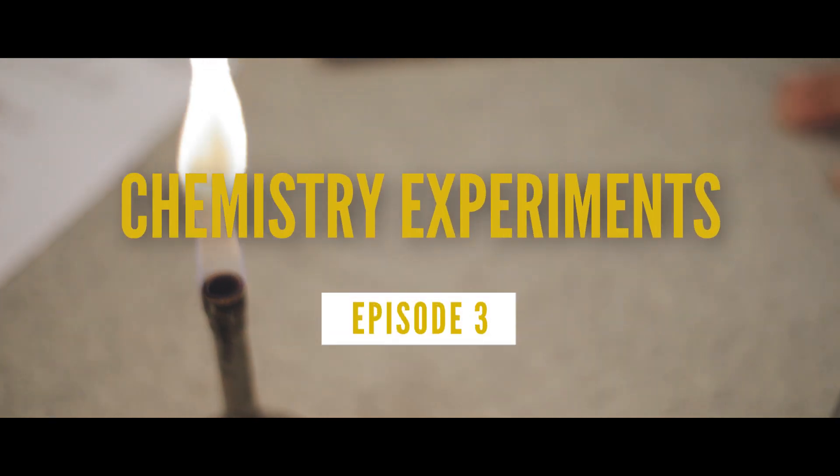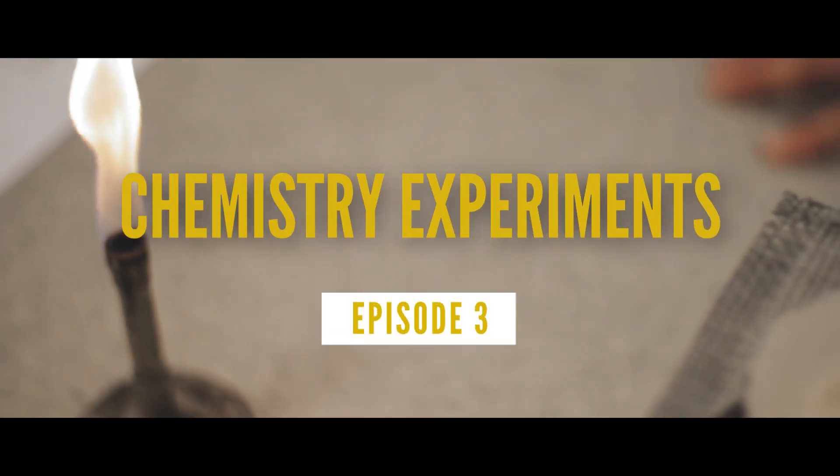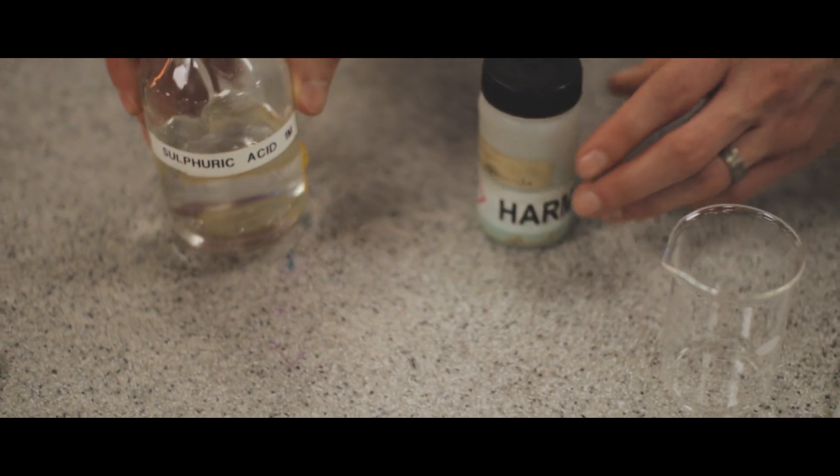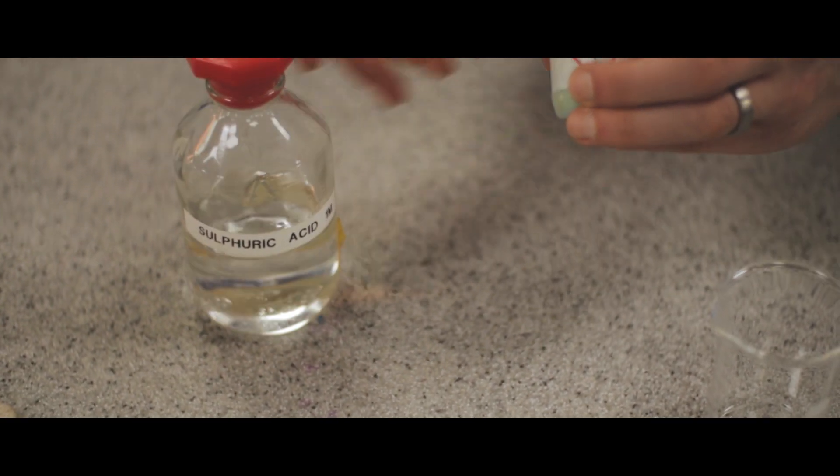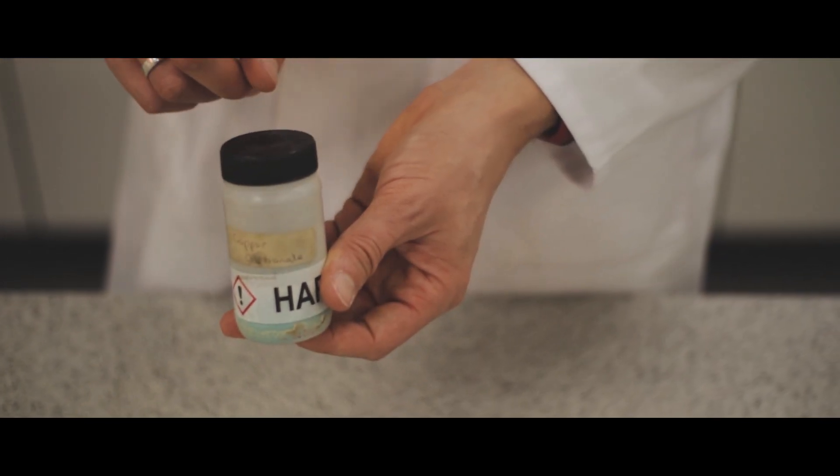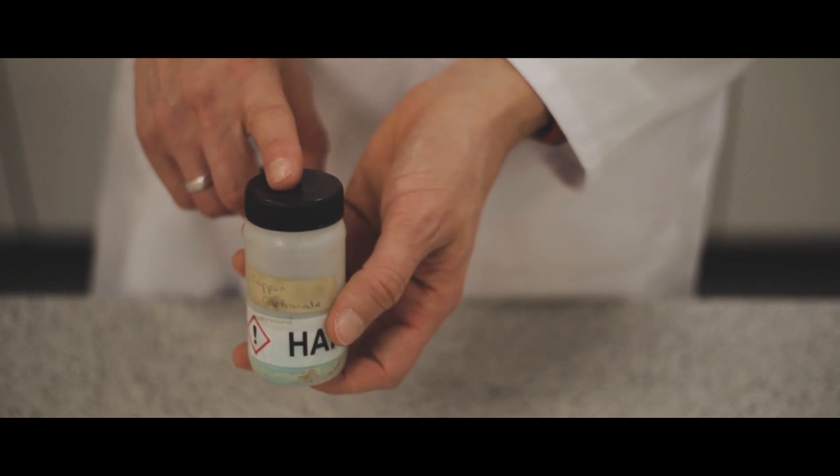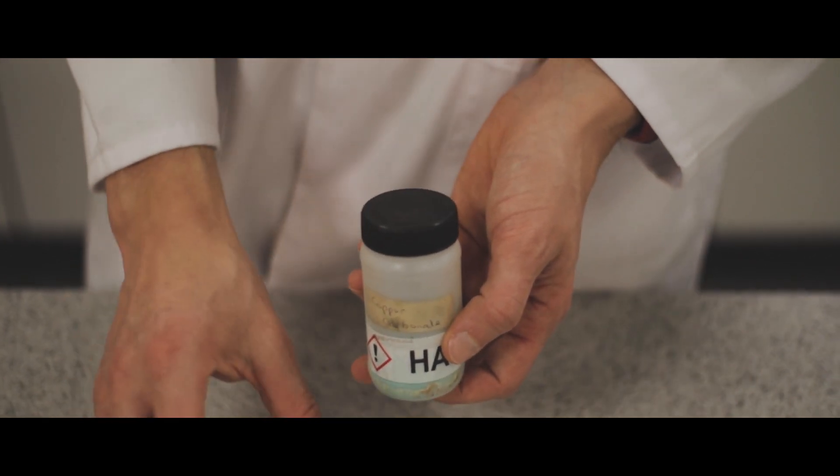In this experiment, we're going to be producing a metal salt. We're going to be producing copper sulfate by reacting sulfuric acid with copper carbonate. So that's going to make the salt copper sulfate, but we're also going to make carbon dioxide and water.